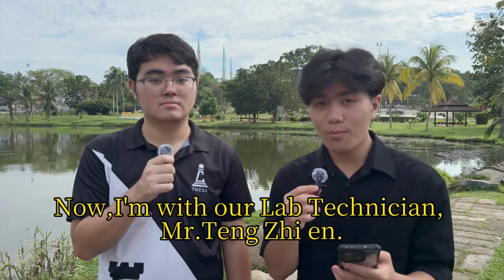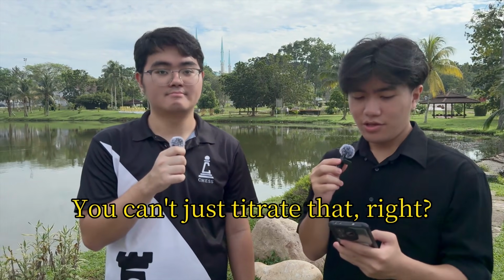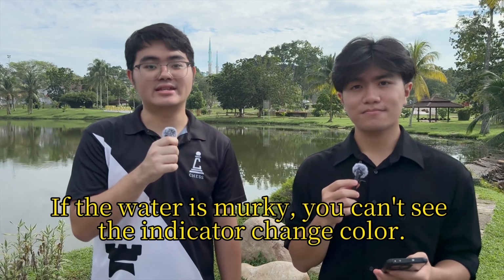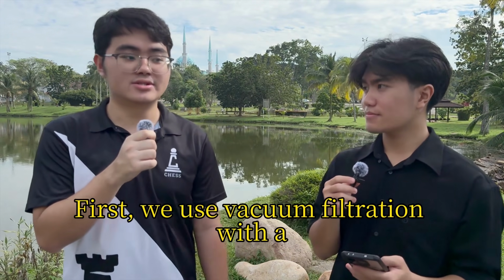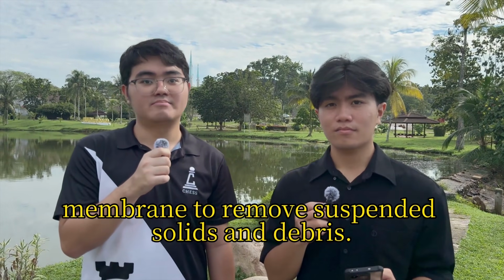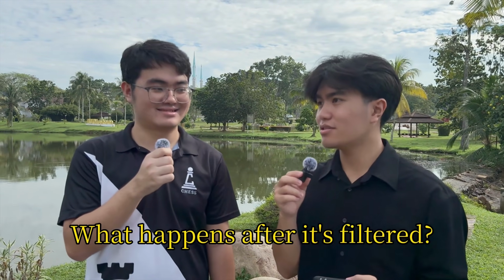Alright, now I'm with our lab technician, Mr. TENG. River water is full of mud, right? You can't just titrate that, right? Yeah, exactly, Stephen. If the water is murky, you can't see the indicator change color. Sample preparation is mandatory. So firstly, we use vacuum filtration with a 0.45 micrometer membrane to remove suspended solids and debris. What happens after the water is filtered?